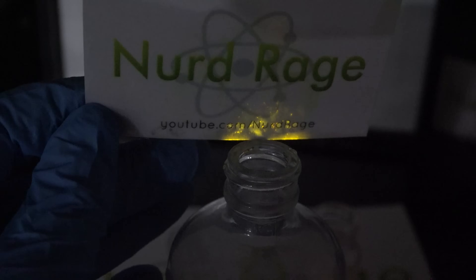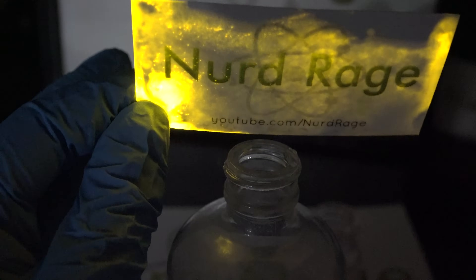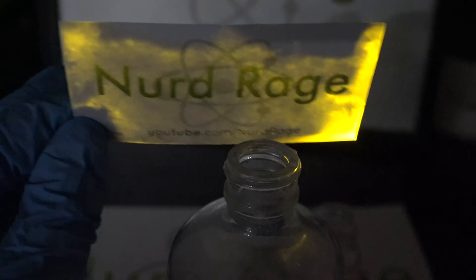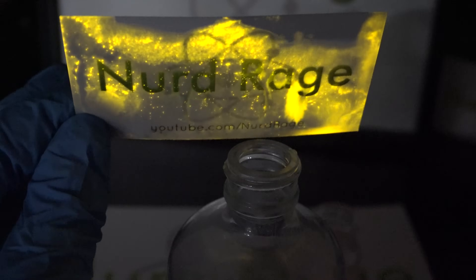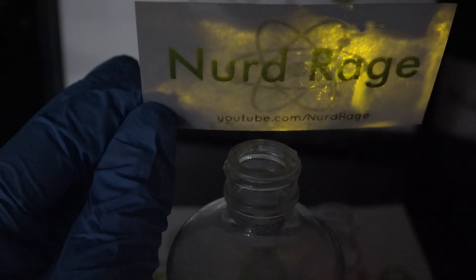So what's happening? When the oxal chloride vapor hits the solution it instantly reacts with the hydrogen peroxide to form dioxetanedione, which in turn reacts with the fluorescent dye to release light. This reaction also works in liquid solution, but I wanted to demonstrate the vapor reaction since it looks so much cooler.